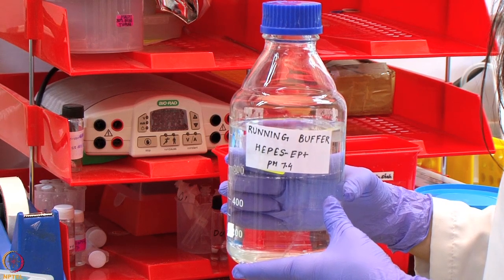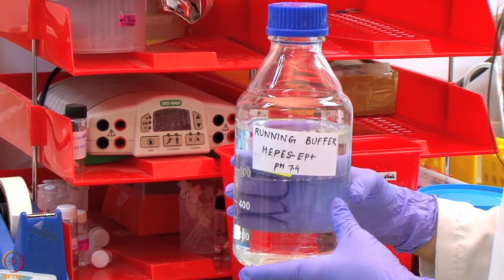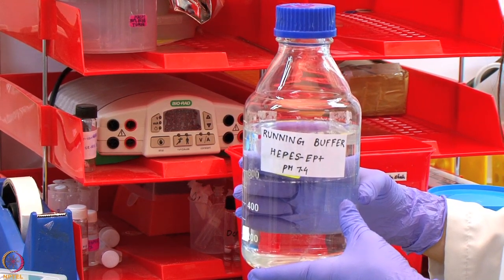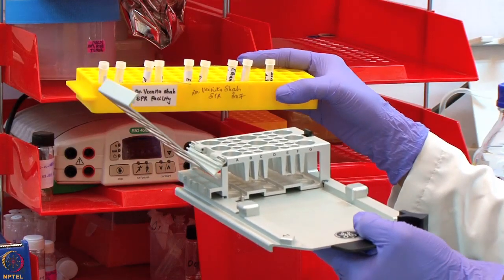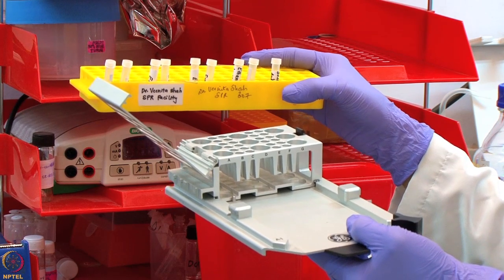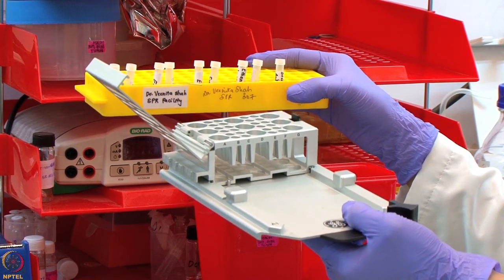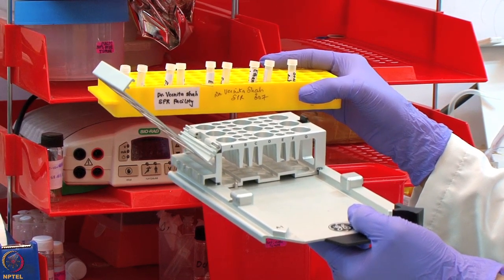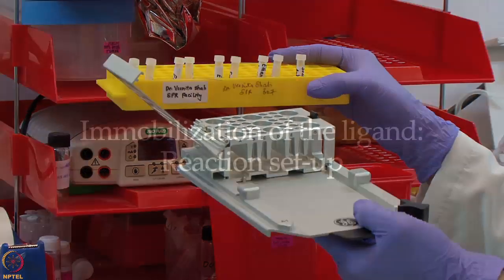We will be using HBS-EP plus as the running buffer, which will be connected to the system prior to the initialization of the immobilization run. We will now proceed to insert these tubes into the appropriate rack and then into the system for immobilization of anti-beta 2 microglobulin on the sensor chip surface.